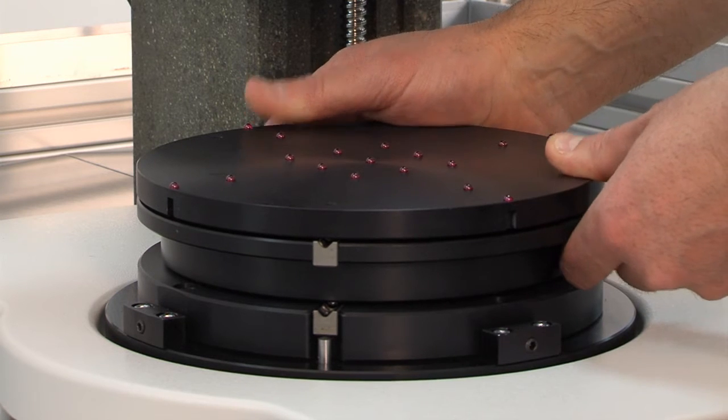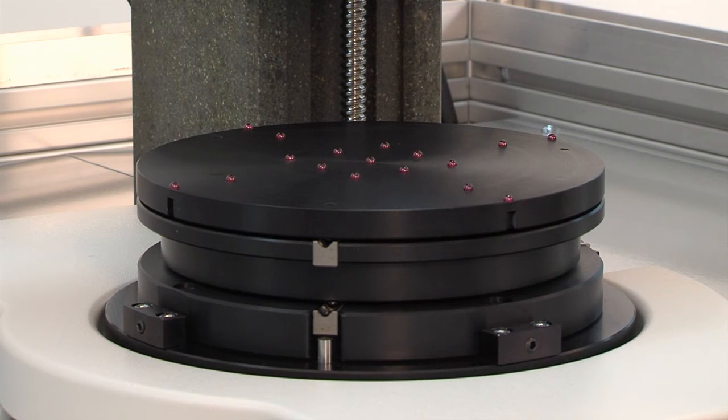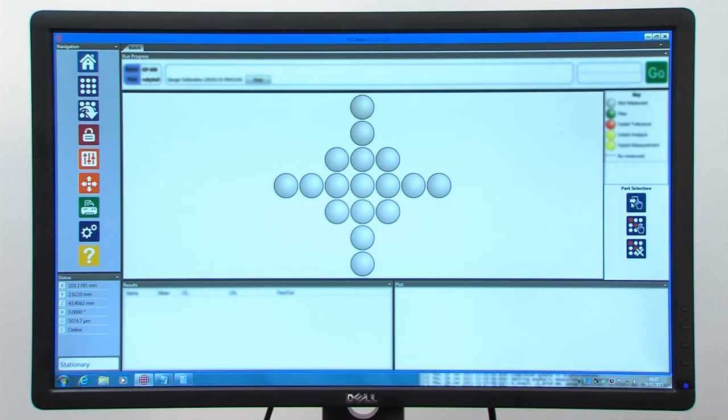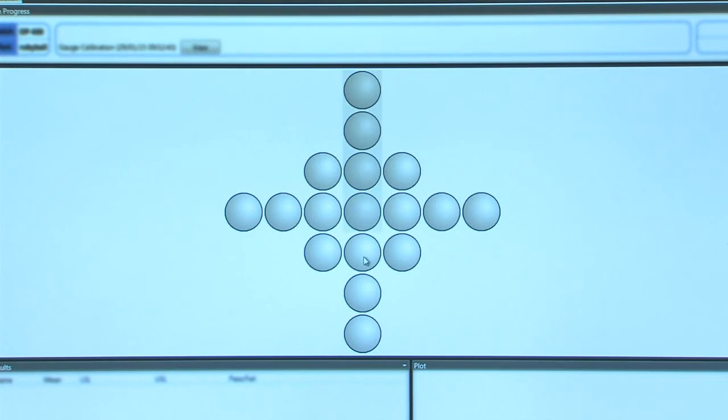Flexibility is a key ingredient of the PGI Matrix. Operators can choose which parts to test by simple deselection. Press go and the fully automated process starts.